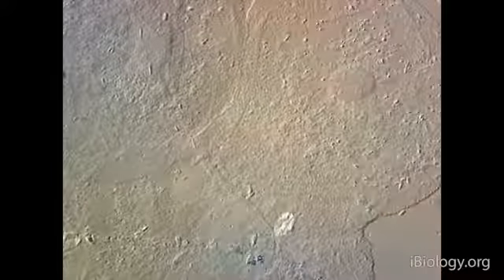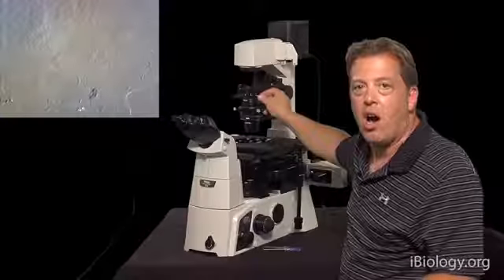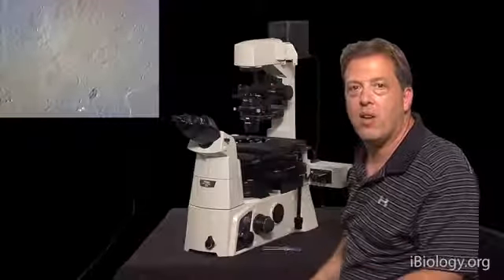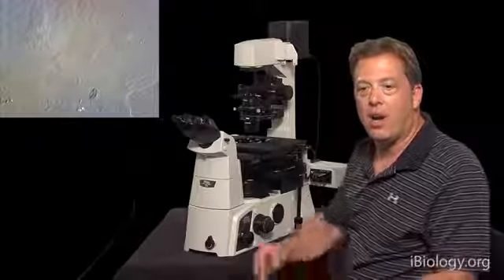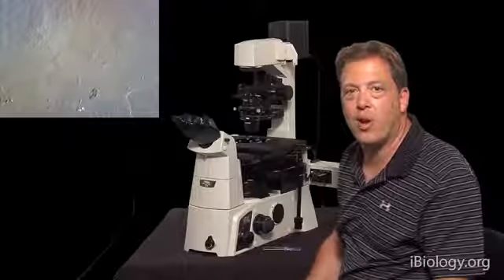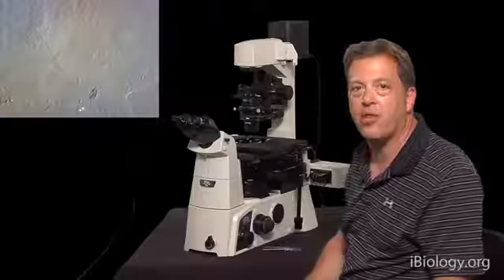Now, the other thing that's important to notice is that when you're going on the other side of extinction, you actually change the directionality or the shadowing of the DIC image. So you can see the shadow on one side, and going through extinction to the other side, the shadow flips orientation. It looks like the light's coming from the other direction. In DIC, it's actually very important, if you're looking for contrast, that you orient your specimen to enhance the contrast of the structures you're interested in, because you only have the contrast in one orientation in differential interference contrast.